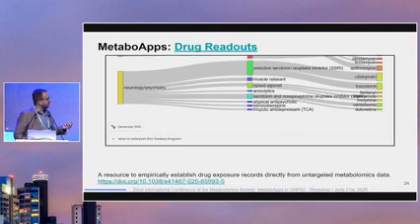And you can also generate the SVG file to edit some information if you want to change the classification that you're using, or just to make the image a little bit prettier. For example, in this case, the classification is so large that it overlapped the other tag.